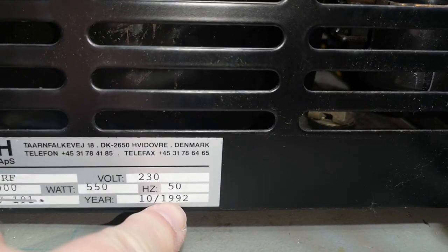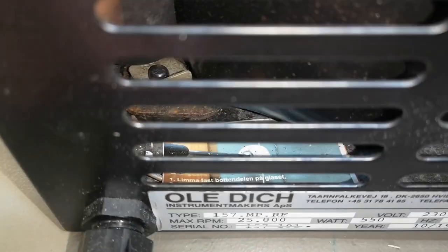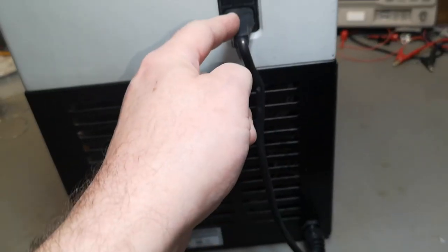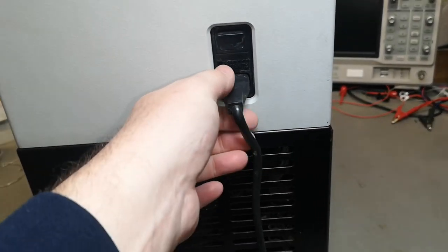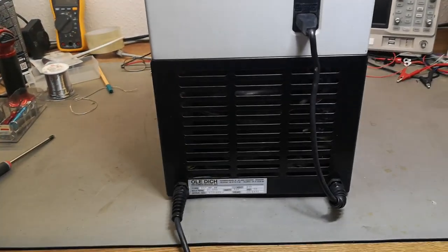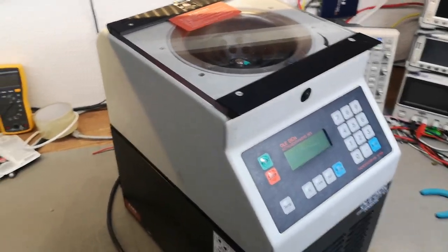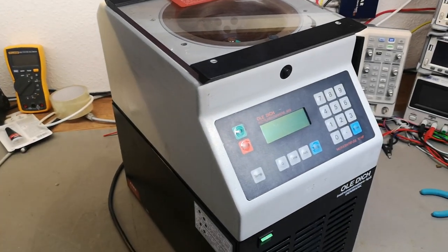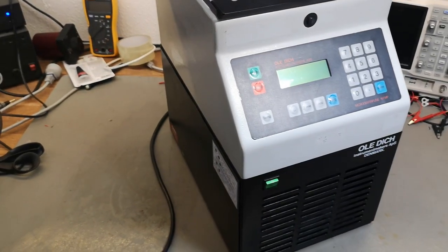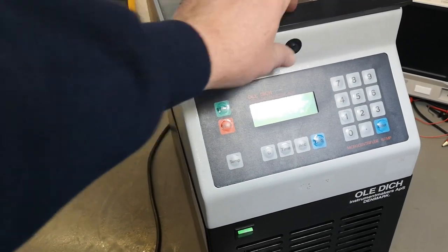The label confirms it's from 1992 — quite interesting. Somebody left a funny note in there explaining that power goes in and then out again and then into the main unit. That's definitely intentional. I think we should just try and power it up and see if it takes the fuses.